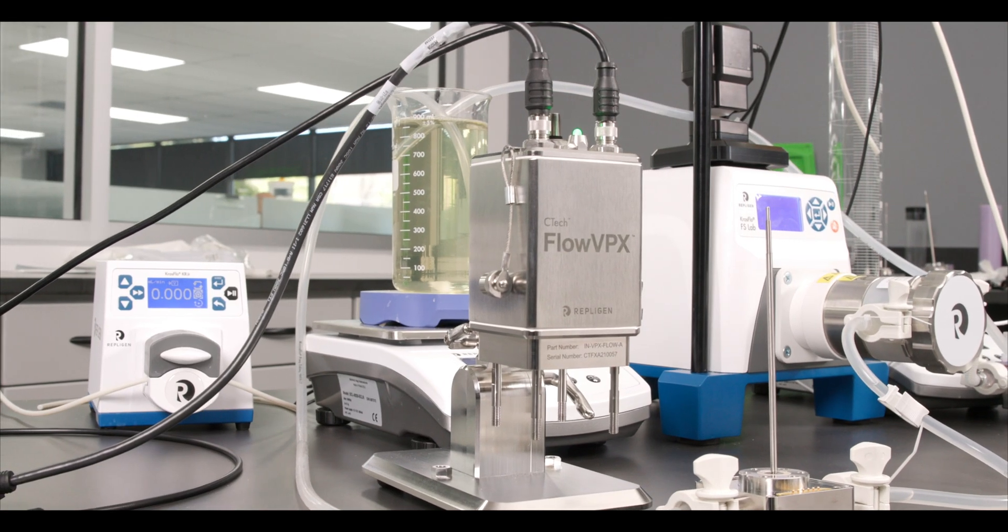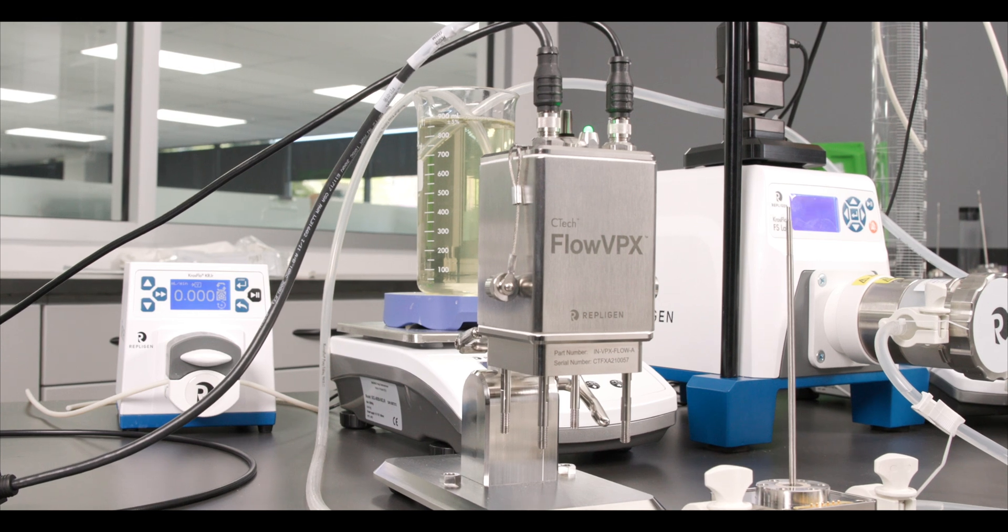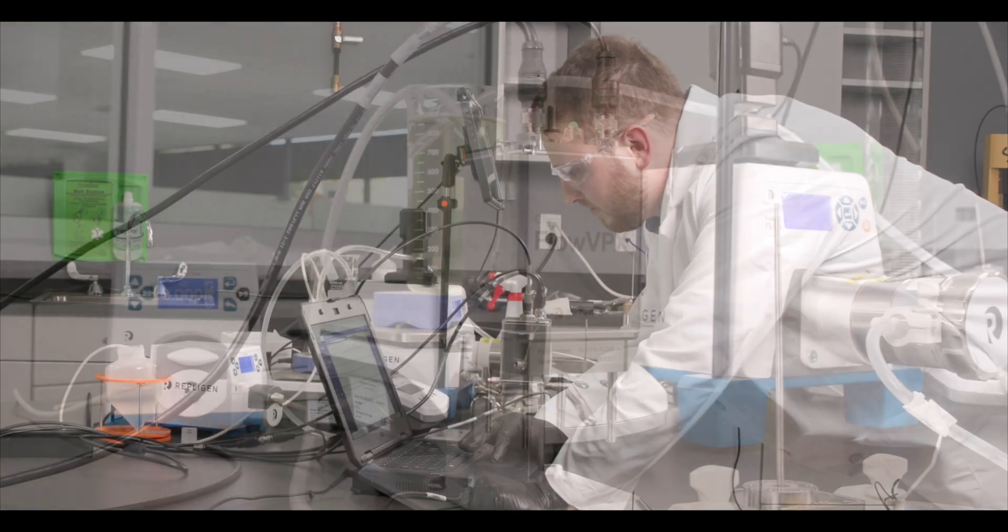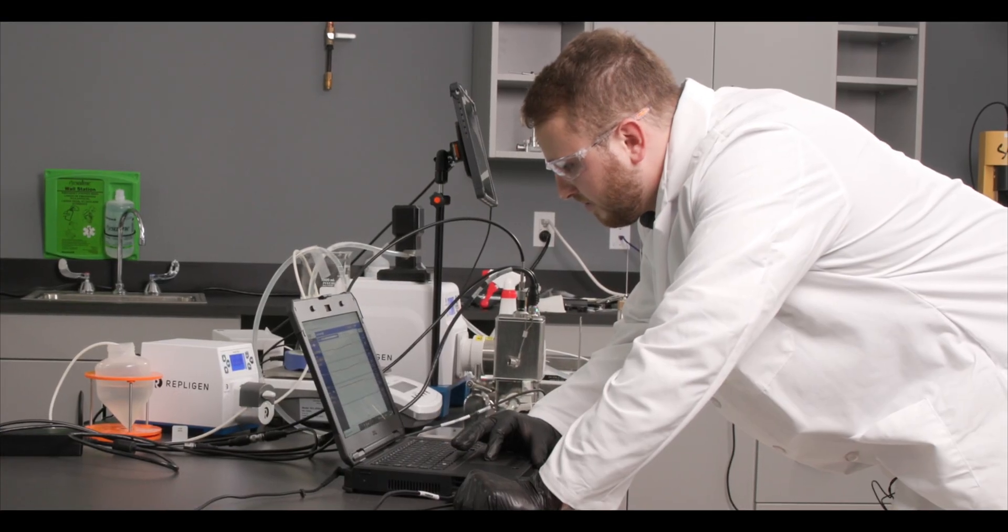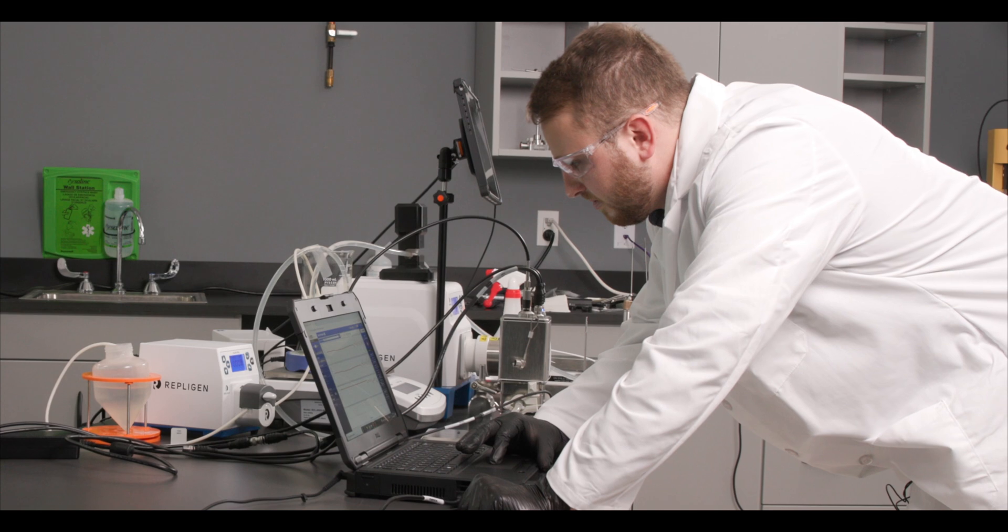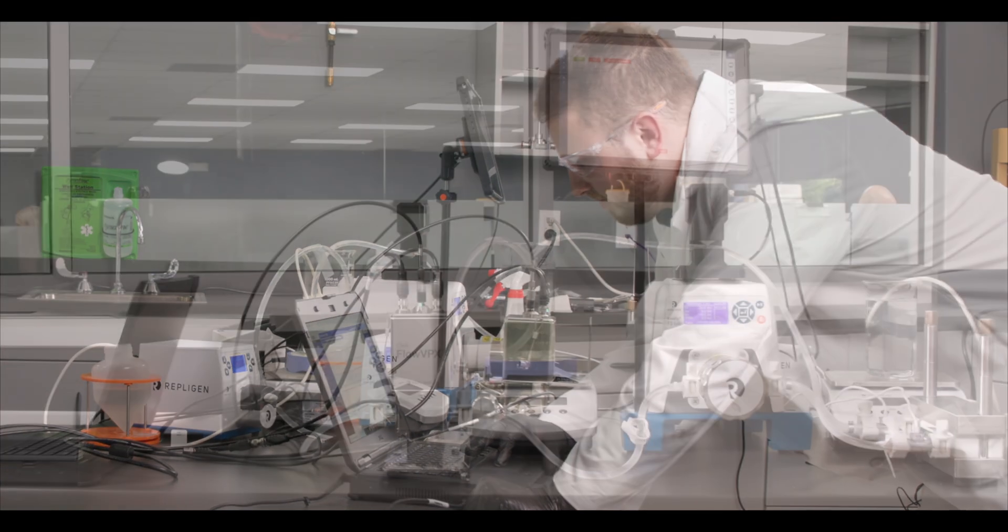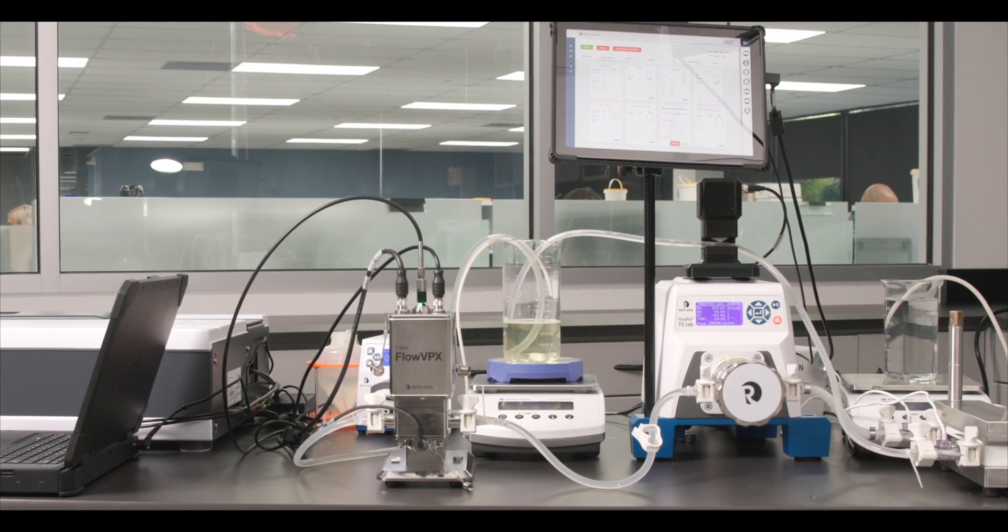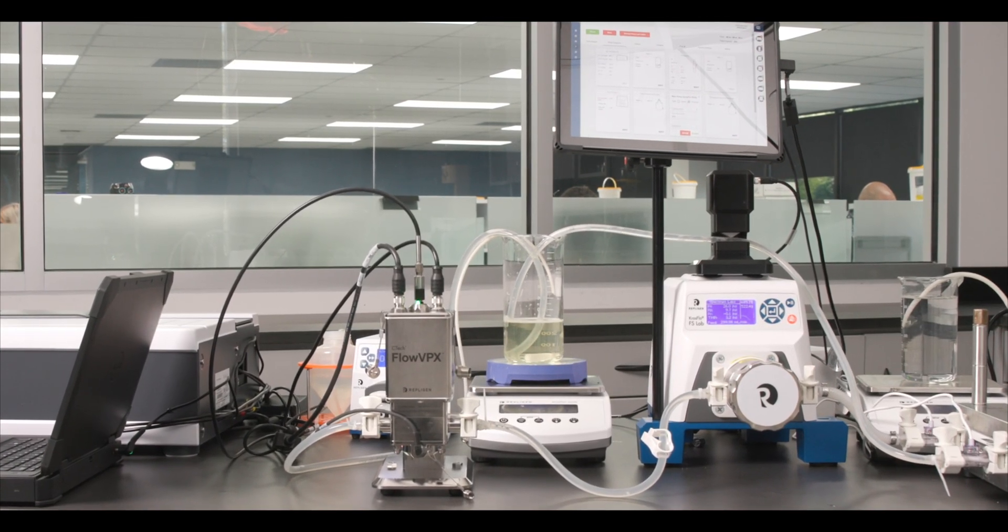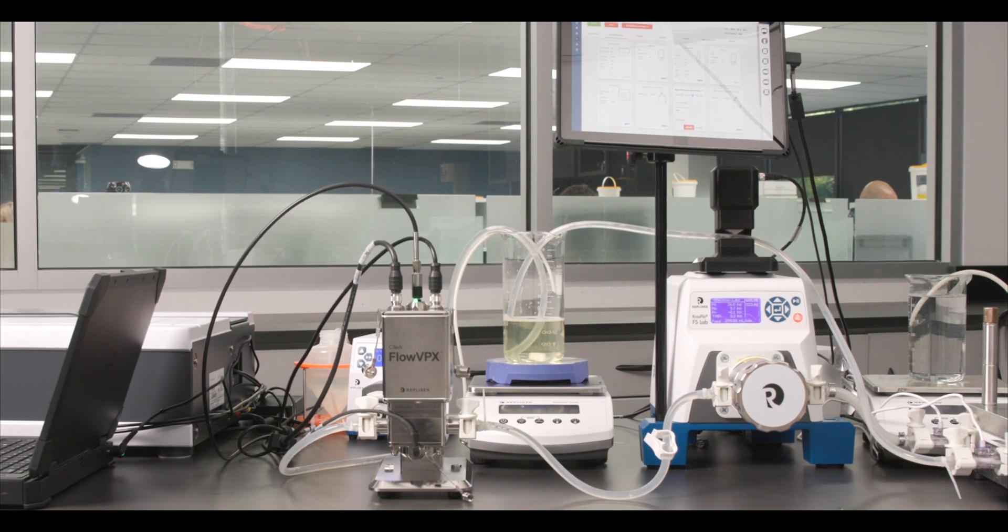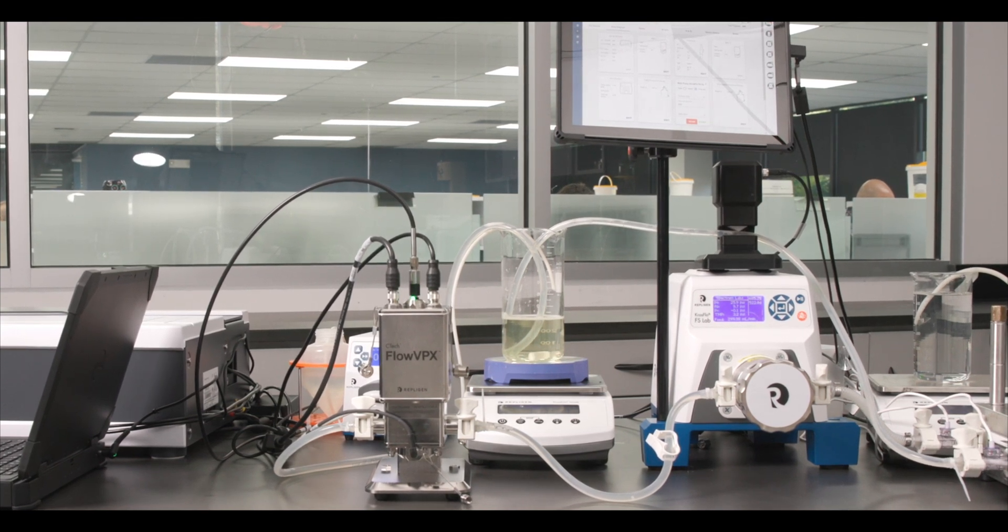Today we want to demonstrate how the CTech FlowVPX system allows you to monitor your sample inline for better and finely tuned process understanding and control. We'll be running an ultrafiltration diafiltration process with the CTech FlowVPX system and KrosFlo FS Lab system.